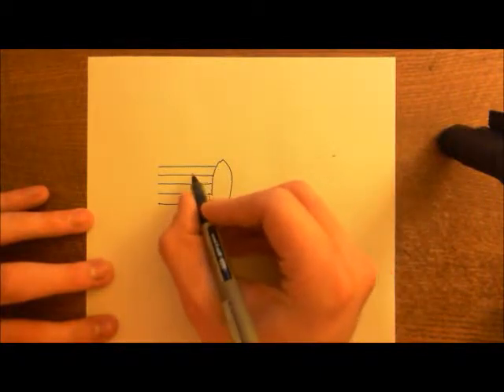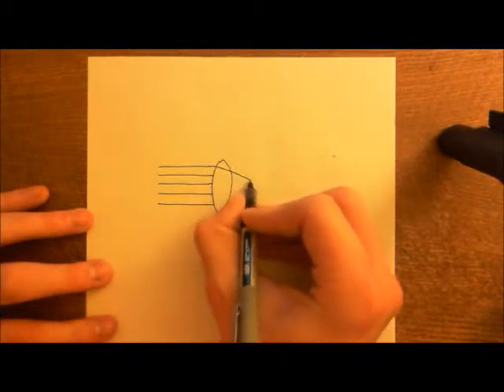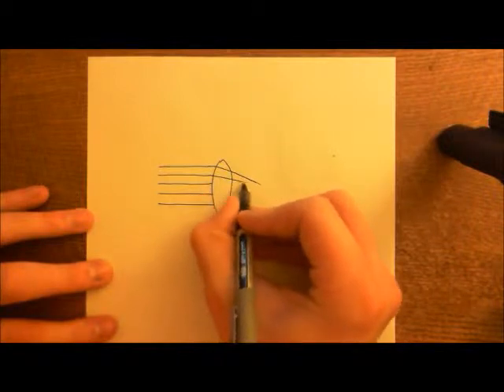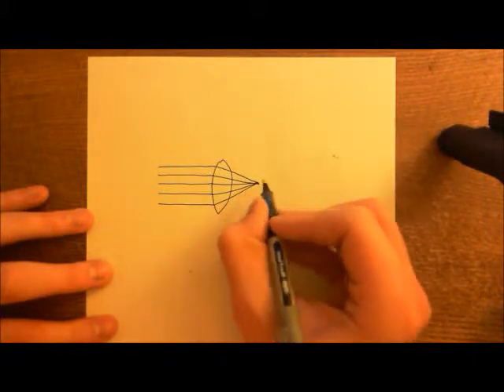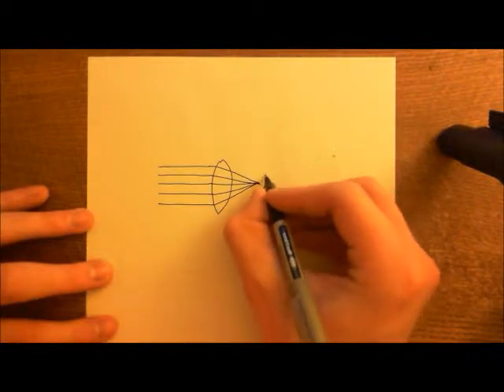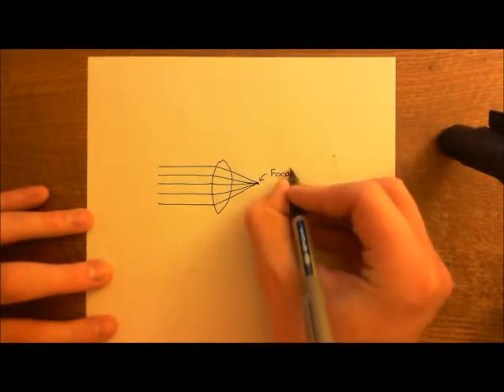Now we've got light coming in horizontally, and all of it is going to be focused down to the focal point. So all of the light that's coming in horizontally will be focused to a single point, and that point will be on the back of the retina. Here is a focal point.